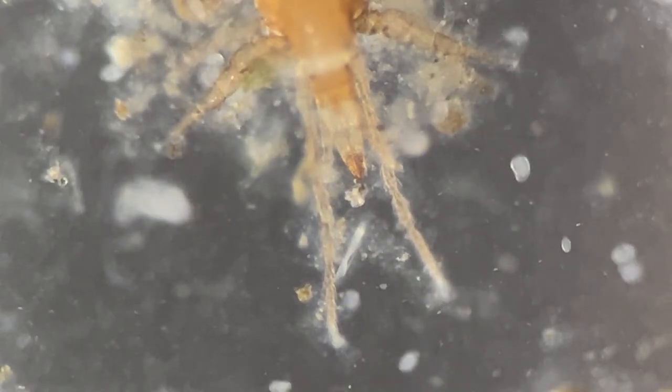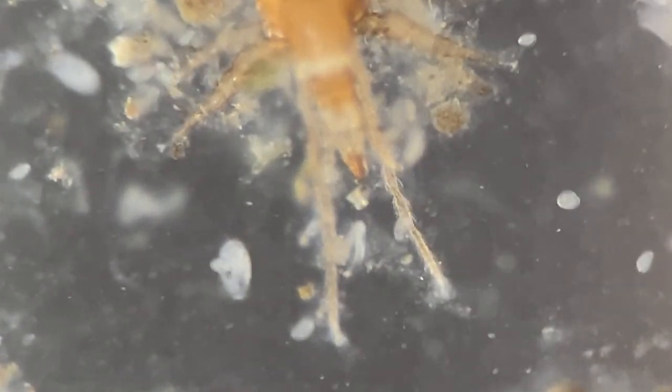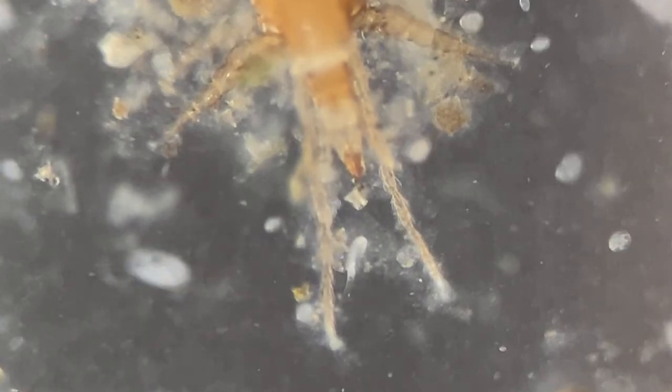The protozoans moving around, they are more real.